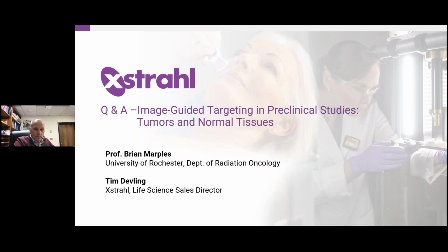Cool. And I'm just going to finish up with one final question, and this is more of an opinion, because you showed two nice examples of contrast-enhanced imaging and also fiducial-based imaging and targeting. Do you have a preference? Do I have a preference? Well, I think for the contrast, it's retro-orbital injection, and you're limited to the number of times you can give that to a mouse per week, because we need it every time we image.